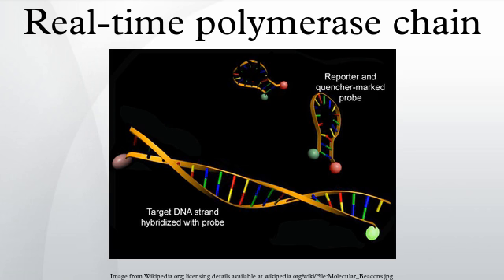Diagnostic uses. Diagnostic quantitative PCR is applied to rapidly detect nucleic acids that are diagnostic of, for example, infectious diseases, cancer and genetic abnormalities. The introduction of quantitative PCR assays to the clinical microbiology laboratory has significantly improved the diagnosis of infectious diseases, and is deployed as a tool to detect newly emerging diseases, such as new strains of flu, in diagnostic tests.